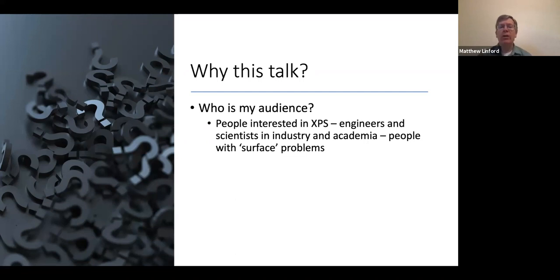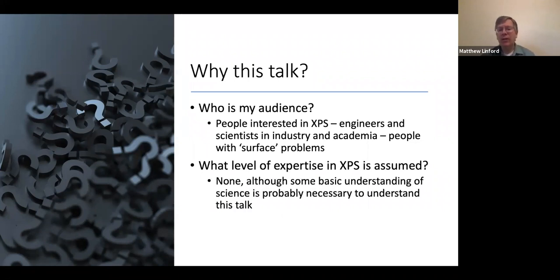I'm assuming that we're dealing with engineers and scientists in both industry and academia, and people that you might say have surface problems, because these would be people that recognize that XPS is a surface technique, as we will discuss, and that this can provide very valuable information about surfaces. Now, what level of expertise is assumed here with regards to XPS? The answer is that I'm not expecting that you have any understanding at all, although I think it would be helpful to have some science background here. So, something like a BS in physics or chemistry or engineering. If you have that kind of background, you'll probably be able to understand what we're going to talk about here pretty well.